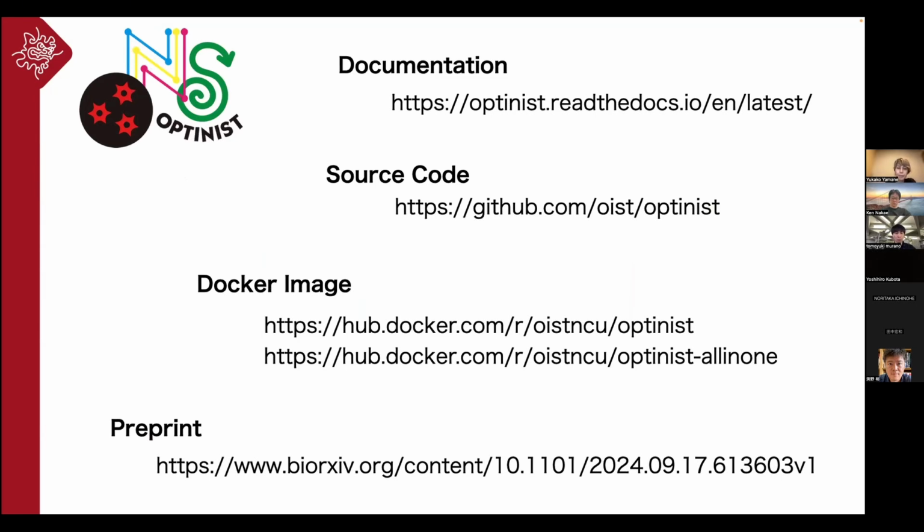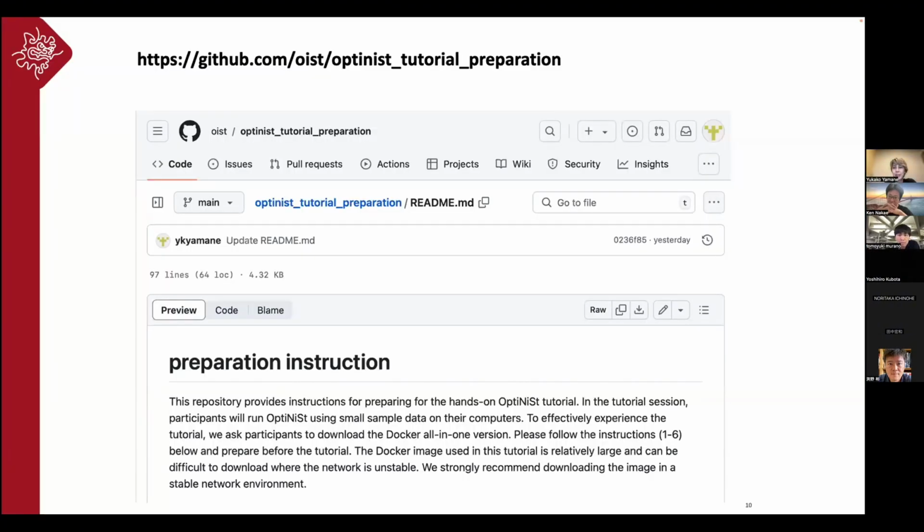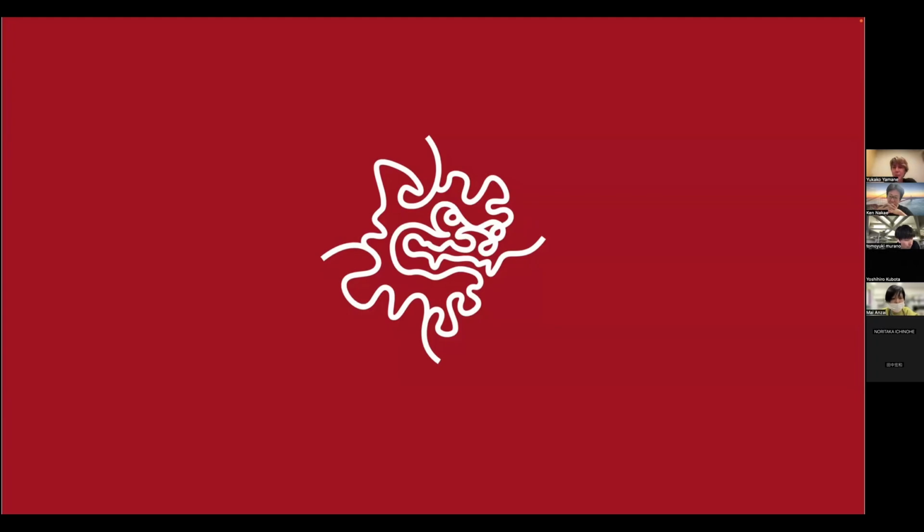Okay. So, any questions? I have some questions. Maybe you will explain OptiNiSt in more detail next time. And currently you are showing the bioRxiv paper. So is this lecture based on the bioRxiv paper, or in more detail? It's basically based on it, but it's more like a hands-on tutorial. So I'm gonna talk by running it. It's not exactly the same thing, but a very similar pipeline is used. Okay, I understand. Thank you.